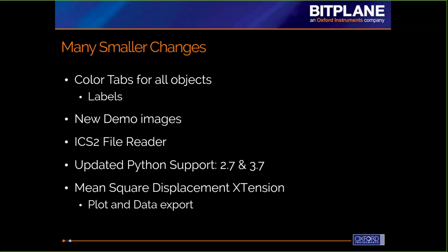Python, the Python version support has also been improved. We are supporting both 2.7 as well as 3.7, importantly, along with this release, and so we're excited about that.